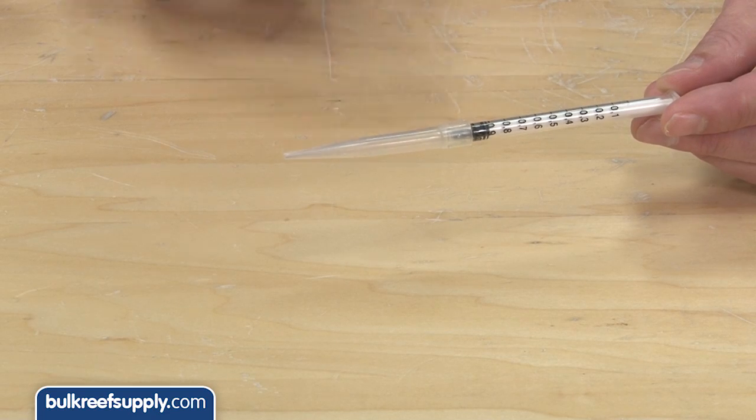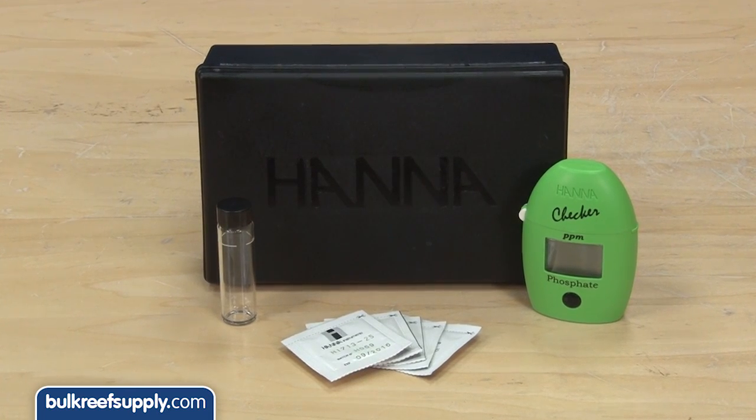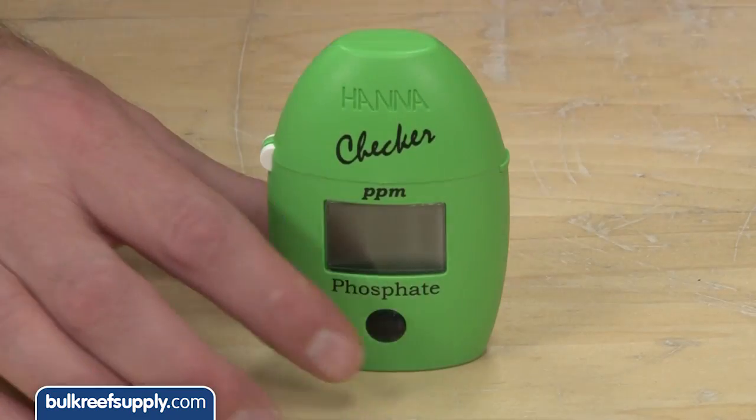The reagent syringe comes with a special tip you can use if you like, but it is not necessary. The other checker we are going to demo today is pretty much just as easy and measures phosphate. This one is pretty valuable because all of the phosphate test kits out there are pretty much impossible to confidently read — the subtle shades of blue they present make it difficult. The process is basically the same.